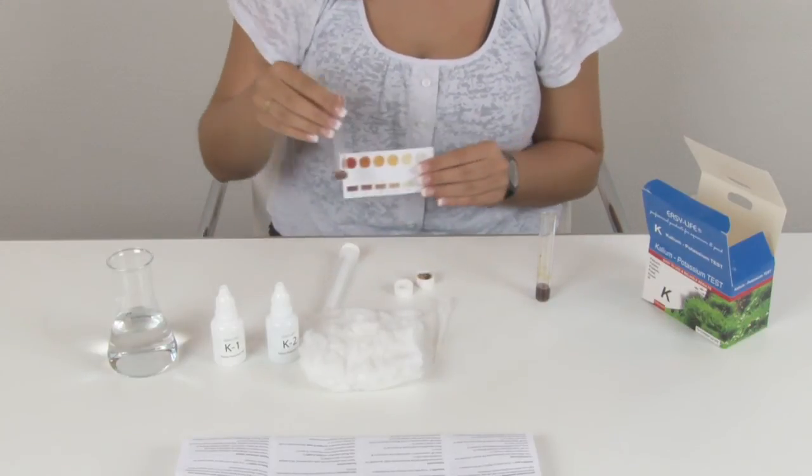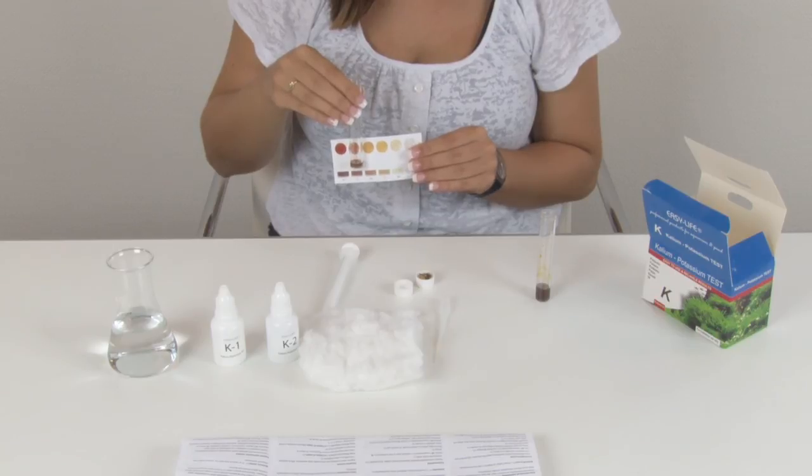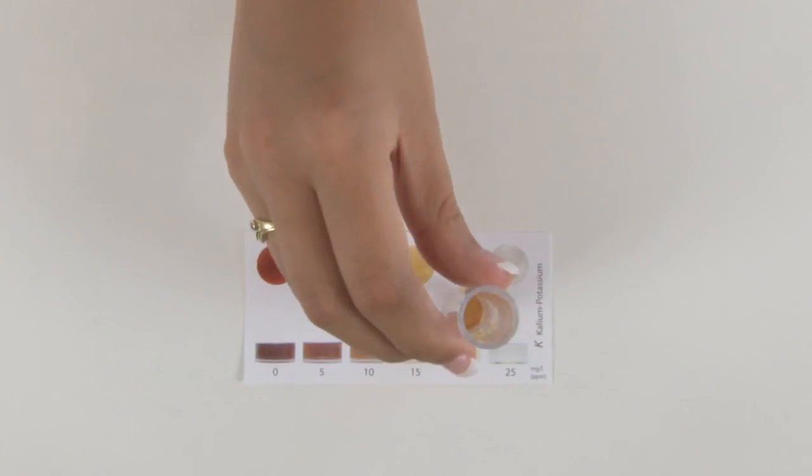There are two ways to compare the color of the liquid: hold the tube against the ColorChart, and/or watch it from above.